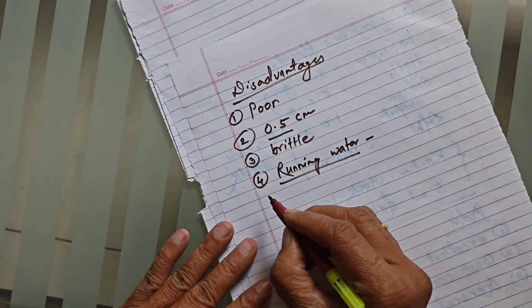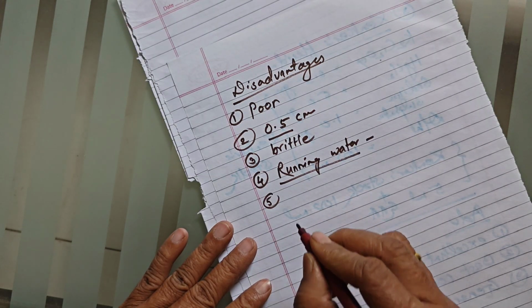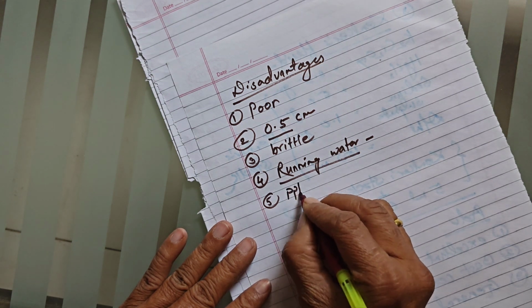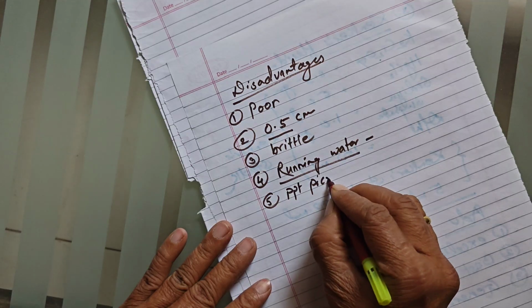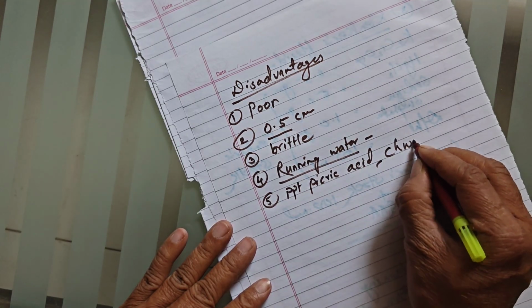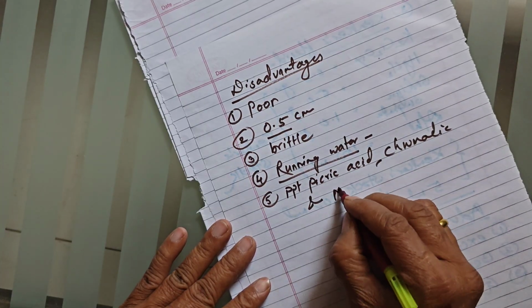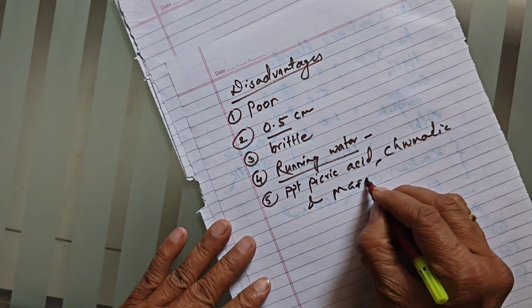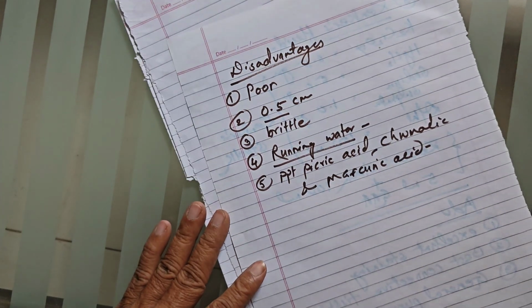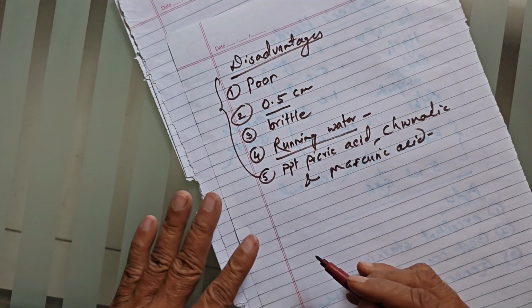And the fifth disadvantage is that the tissue forms precipitates of picric acid, chromic acid, and mercuric acid into the tissue. That's why we are not using this fixative.